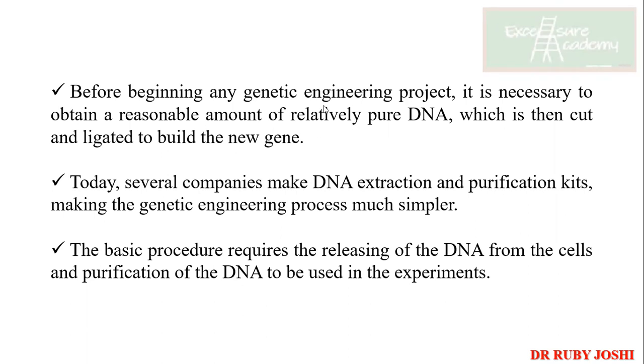Before starting any genetic engineering project, it is always reasonable to have a pure amount of DNA, which can later be cut with the help of restriction enzymes and ligated so that you can have a new gene, or you can go for cloning. There are many companies which make DNA extraction and purification kits. You must have heard of Novozymes, Thermo Fisher, Abbott, BioEra. Now many more have come.